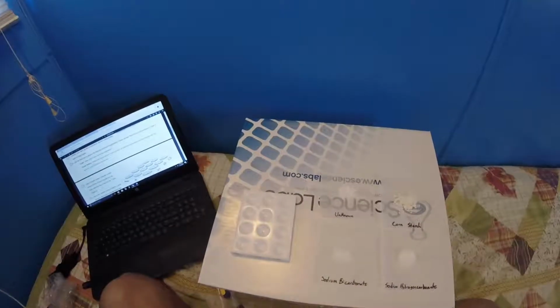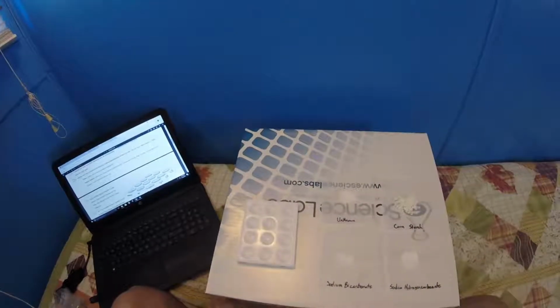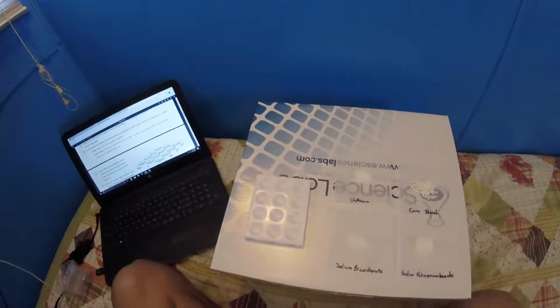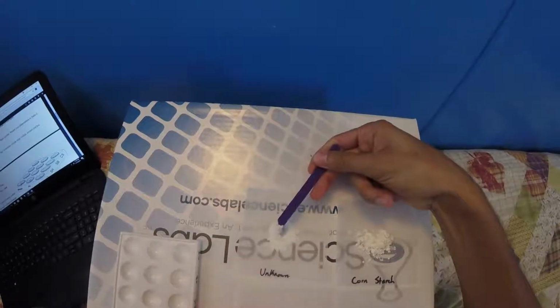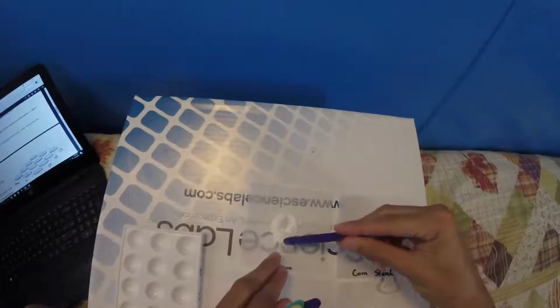After we do the hand lens, we have to grab a wooden scoop to transfer a small amount of the unknown sample into the 3 wells that are in line with the U label. So for the unknown one, take a scoop of this and put it into the unknown one.